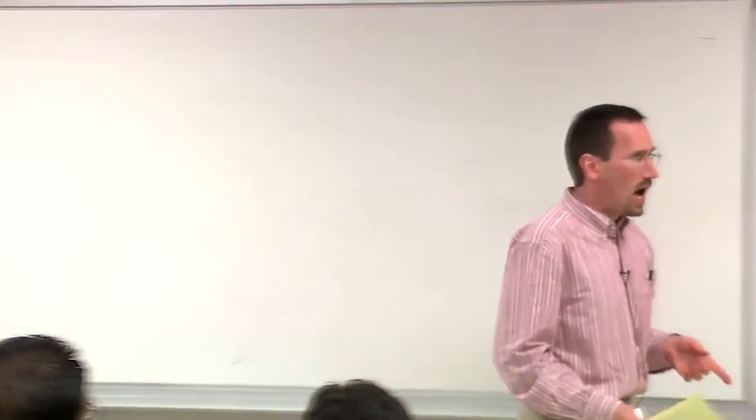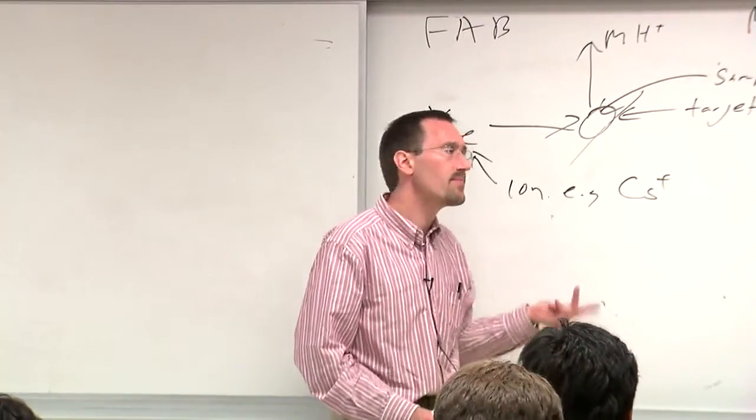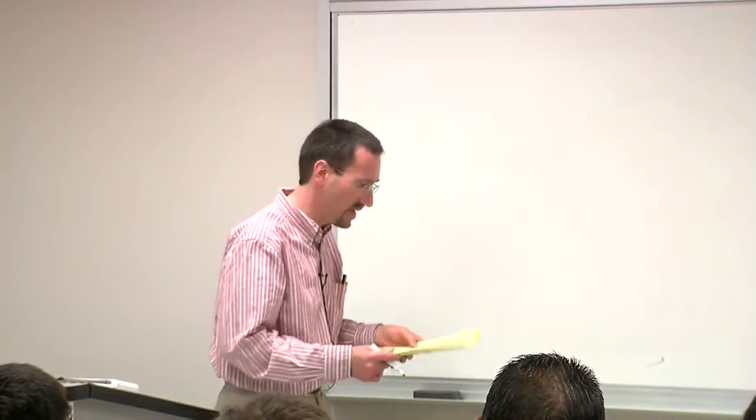Does that change the type of detector you can use if the molecule's really big? It does. You can go with stronger magnetic fields, or I think typically this is done with a quadrupole. And then for MALDI, which I'll tell you about in a second, often people do time of flight, because time of flight tolerates even bigger mass range.